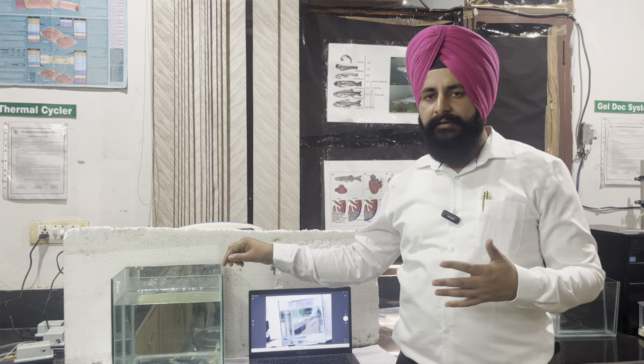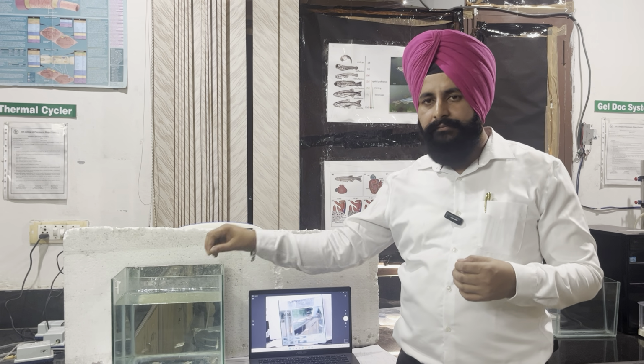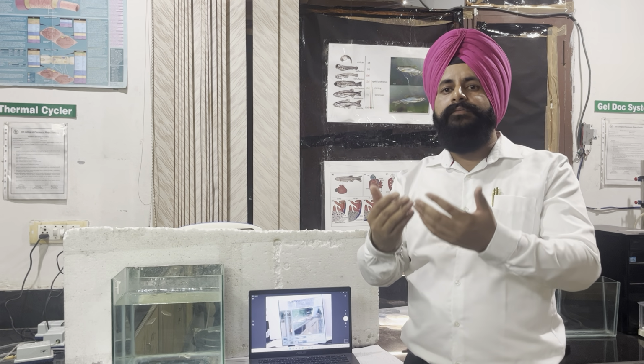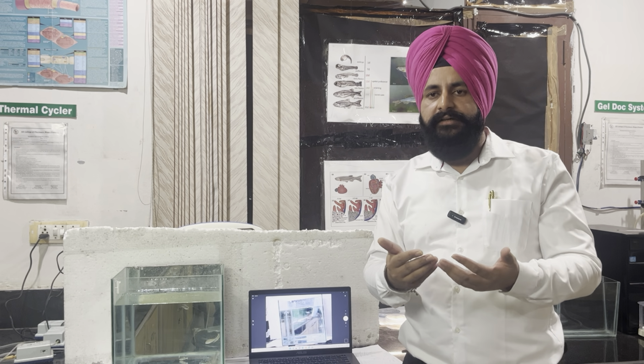Now what will happen here? This is a mirror chamber apparatus. Whenever you keep a zebrafish inside, the inner side is lined with a mirror. So the zebrafish will find that there are some more fishes here. So this is a predator-like condition.